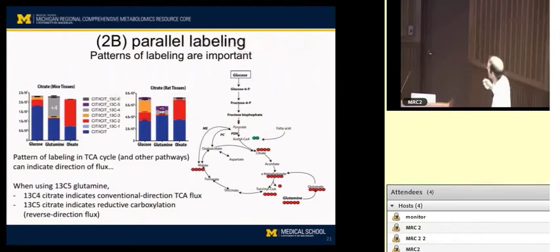It's called reductive carboxylation, so formation of citrate from alpha-ketoglutarate in the reverse of the classic TCA cycle. And so this is something which is activated in cancer metabolism and also under various other metabolic conditions. And so this is a pathway of interest to many investigators. So look carefully at your pattern of metabolism depending on the tracer that you choose. Okay, so yeah, that's what I just said.